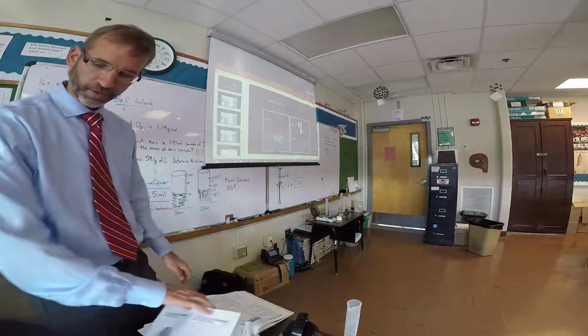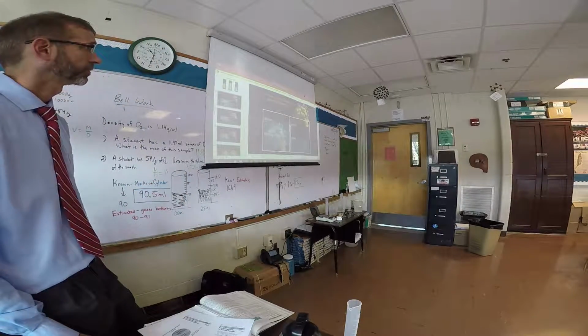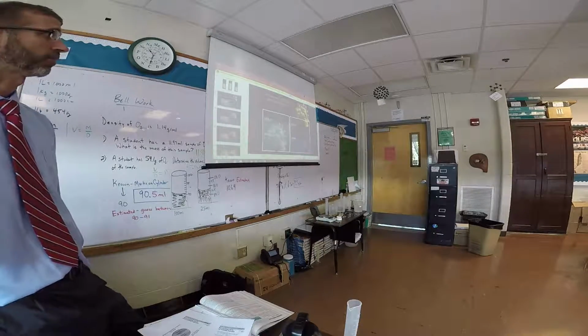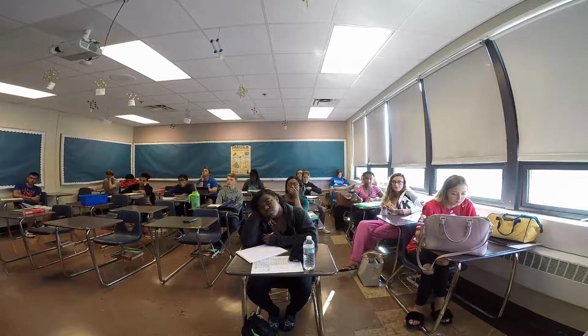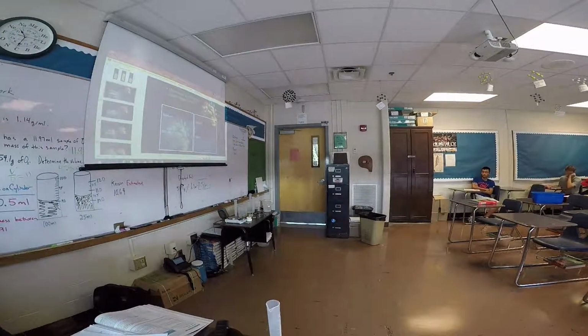So there's a volume you want to take before you take a measurement. We call that the initial volume. So Bowser up here, he's on the far right out of the water. Everybody see Bowser? Where's Bowser from? Mario Brothers, very good. So Bowser is going to go into the water, and he goes into the water.